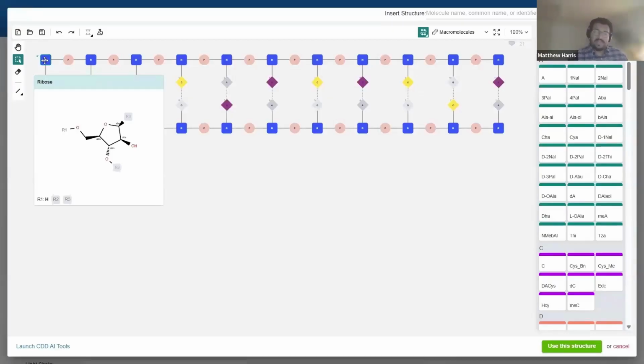One thing we like to say with the macromolecules is that they're being registered in a chemically aware fashion. What I mean is that you can see the correct bond formations, and stereochemistry will be maintained within these macromolecules. You'll also be able to add and use any of these modified or unnatural bases in your sequences, as well as any hybrid sequences, as we saw in the beginning where we added those amino acids to the RNA strand. So the chemically aware registration allows all of those different modalities and information to be captured within these macromolecules.